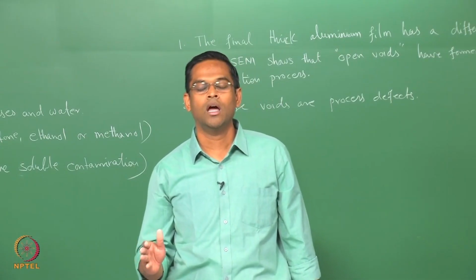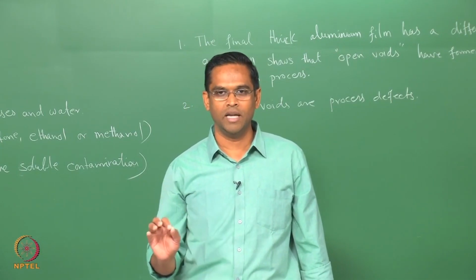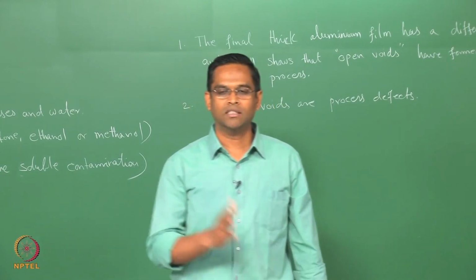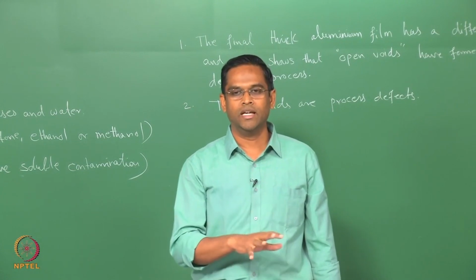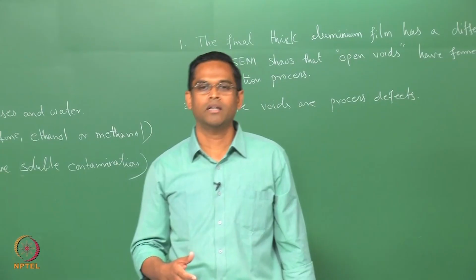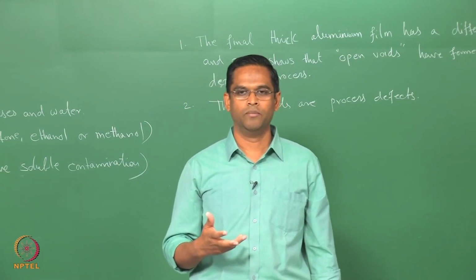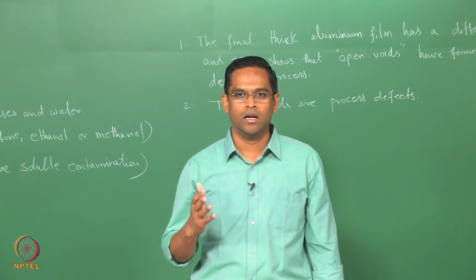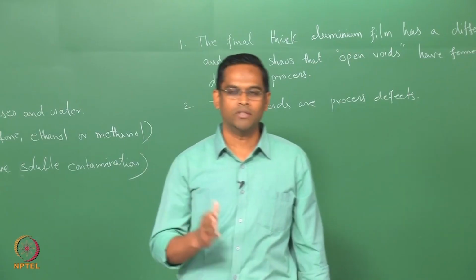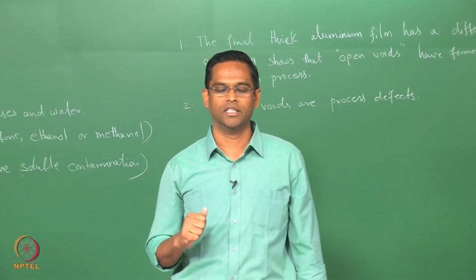You can only say that magnesium and silicon are present in the grain boundary maybe in larger quantities as compared to inside the grain, where they may be there, but beyond the detection capability of this EDS spectrum. That is how you have to interpret. But if you want to say that it is a segregation, then you need to have solubility data and then say that it is segregation.